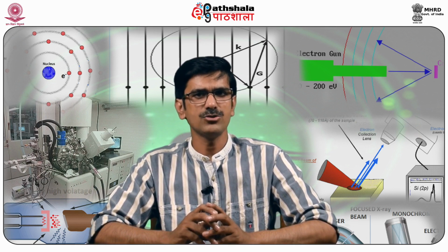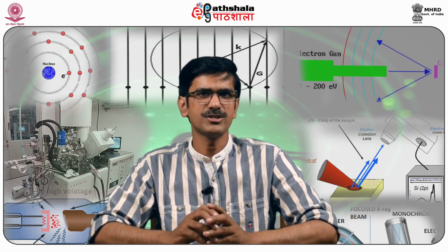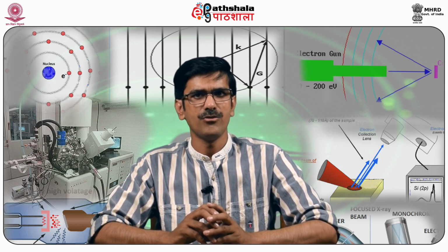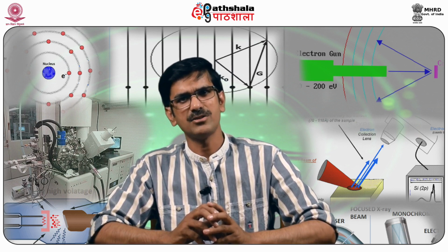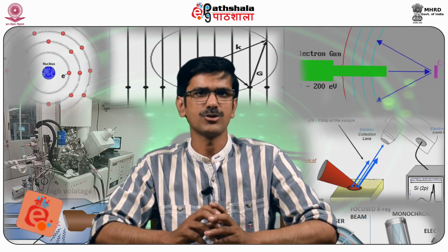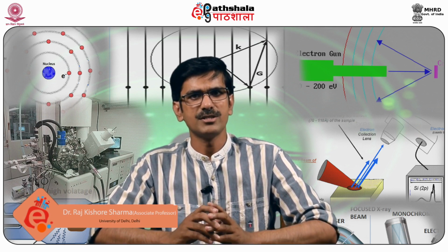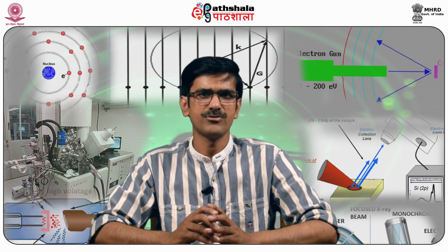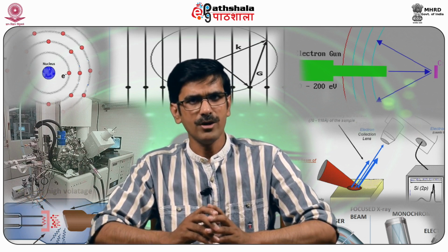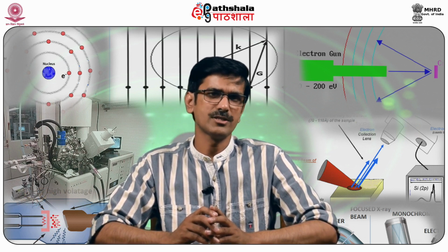A detector is used to convert X-ray energy into voltage signals. This information is sent to a pulse processor, which measures the signal and passes it onto an analyzer for data display and subsequent analysis. The most common detector now is the silicon lithium detector, cooled to cryogenic temperatures with liquid nitrogen. However, newer systems are often equipped with SDD with Peltier cooling systems.